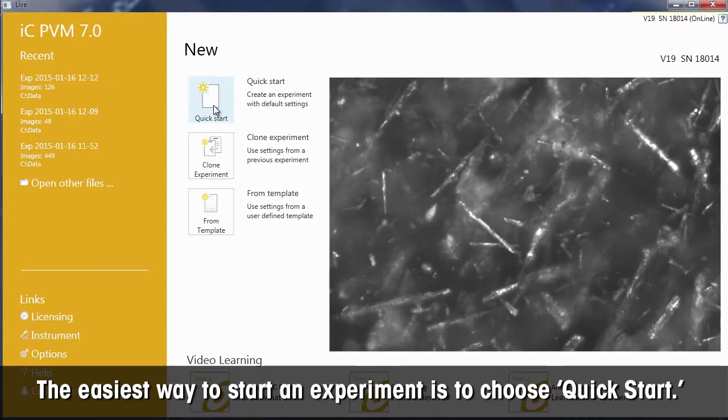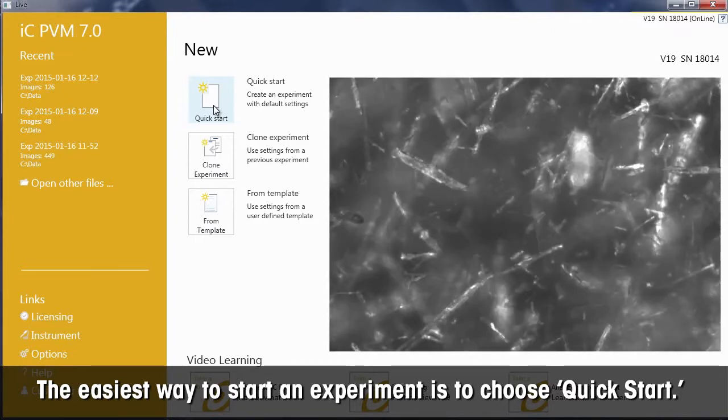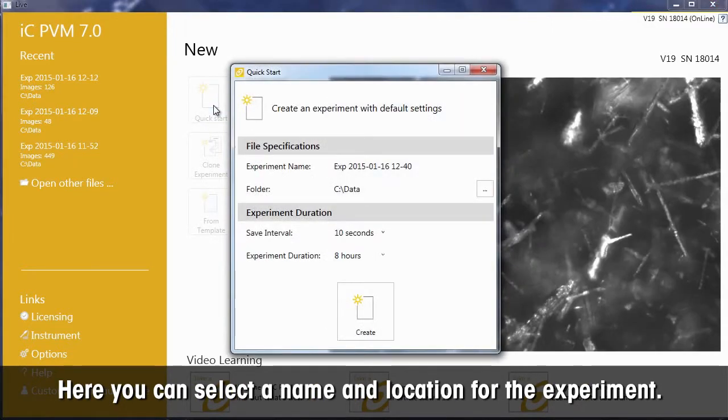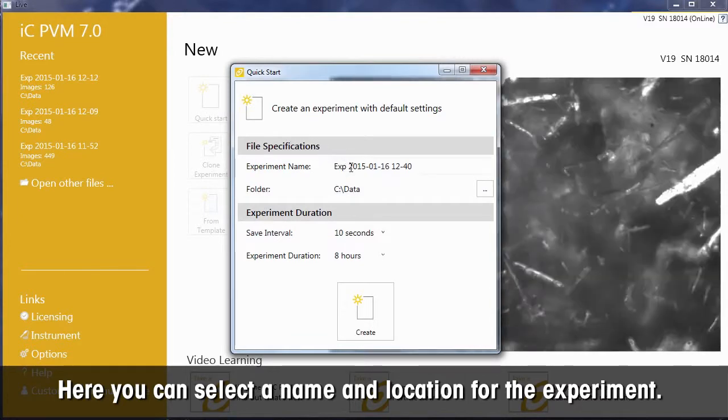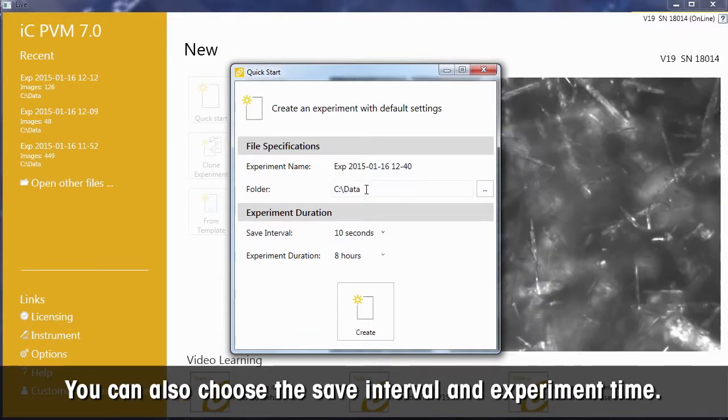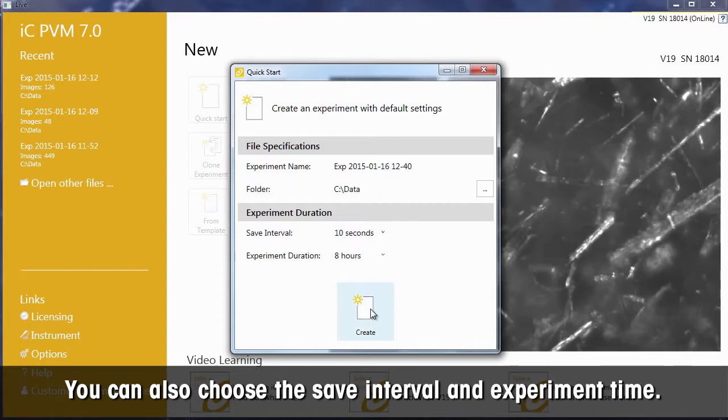The easiest way to start an experiment is to choose Quick Start. Here, you can select a name and location for the experiment. You can also choose the save interval and the experiment time.